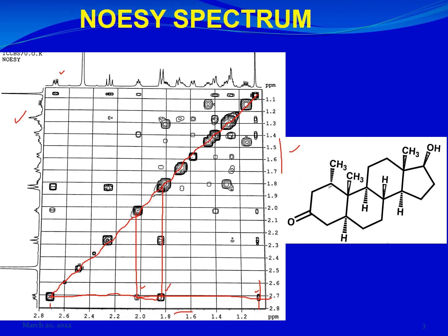Here's another correlation for the proton resonating at about 2.25 ppm. If you go to the right, it connects with the proton resonating at about 1.82 ppm. You can also form squares just like in the COSY spectrum, and you will see the same three correlations on the vertical axis with those squares as well.